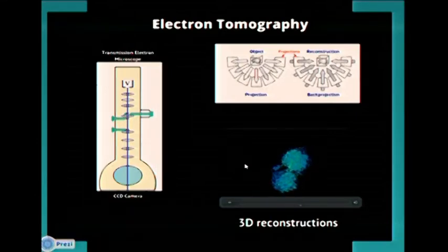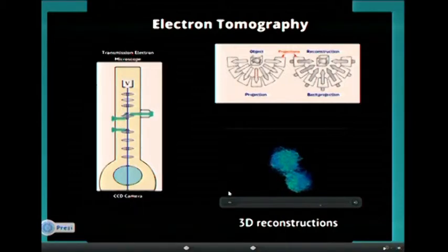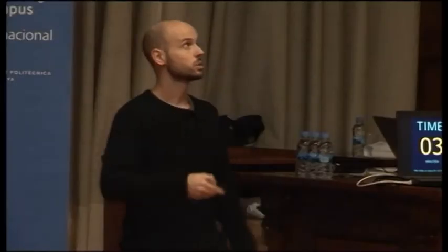So this is one example of the particles I'm going to use as an example for this technique. So here we have no chemical information, we have structure information. So let's go and try to combine both of them.